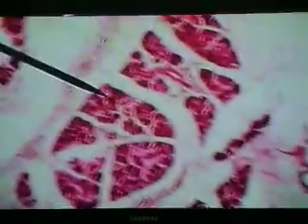parotid here. This parotid here is more diffuse. This is more just towards the edge of the gland. Okay, so you're looking more towards the edge of the parotid here. So there you can see the lobules, but this is just at the edge of the gland. The other one was more in the depths of the gland. But for exam purposes, that's an interlobular duct. You see, we have to look at the epithelium, that's another interlobular duct.